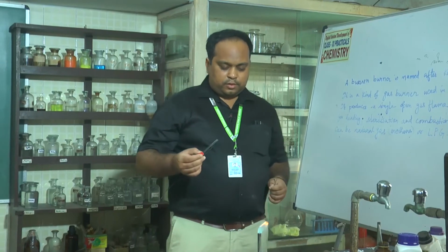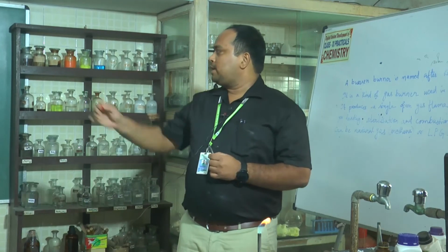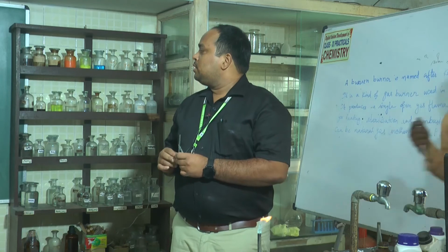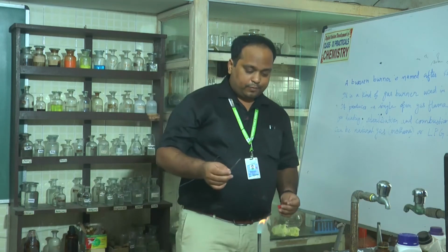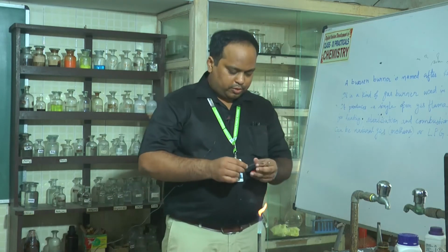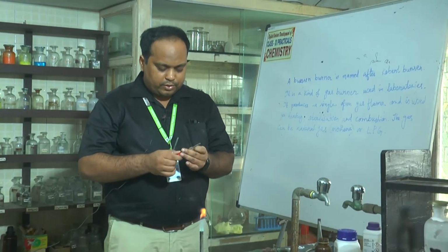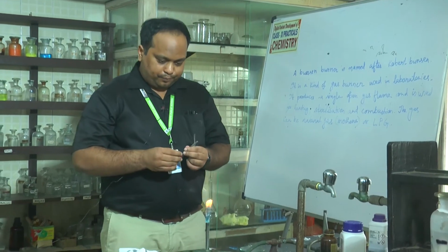Okay, students listen. Next we will start with the flame test. Question: flame test, for whom is it applicable, and why are we doing the flame test?